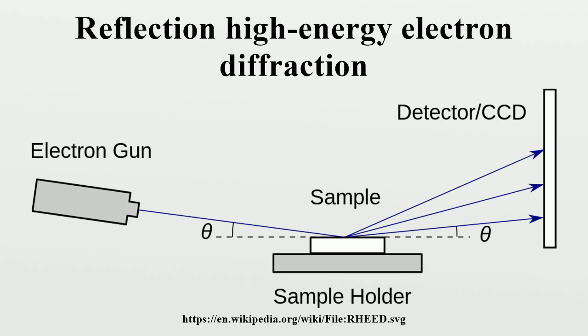Transmission electron microscopy, another common electron diffraction method, samples the bulk of the sample due to the geometry of the system. Low-energy electron diffraction is also surface-sensitive, but LEED achieves surface sensitivity through the use of low-energy electrons.